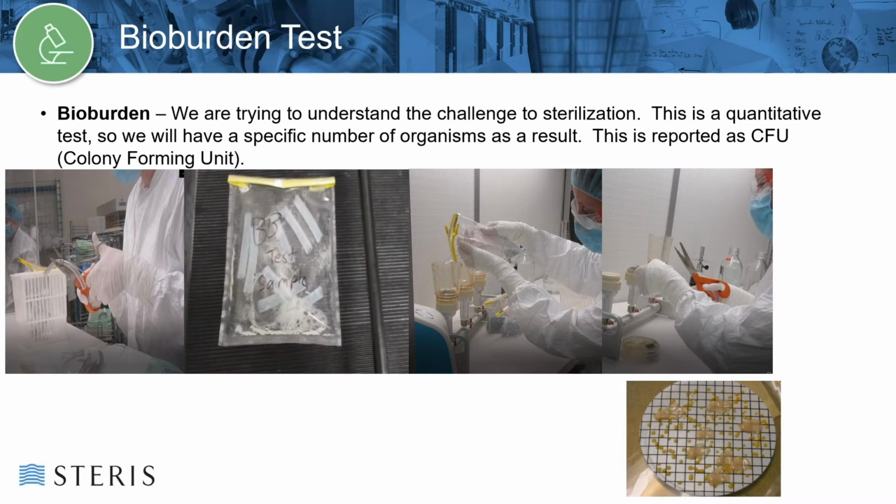After extraction, the liquid is filtered and plated onto agar media, or it may be plated by mixing the liquid directly with molten agar, referred to as pour plating, if filtration is not an option due to the nature of the test sample, whether it is fibrous, powder, or gel. Other culturing methods such as MPN, most probable number, contact plating, and swab culturing may also be options.